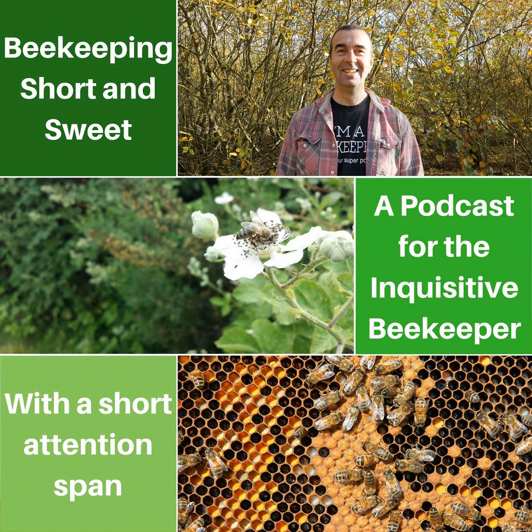Sure. And the same applies to identifying parasites on the different parts of bee. You don't have to have the more expensive ones, but it does add significantly to the pleasure of using them and the ease with which you can use them. And also you can then start to add photography equipment to them and record what you're seeing. And that's, again, something that I've stepped into, recording images from the microscope. If I had the basic setup and wanted to record some images from that, is that going to be quite expensive for me to do, though?